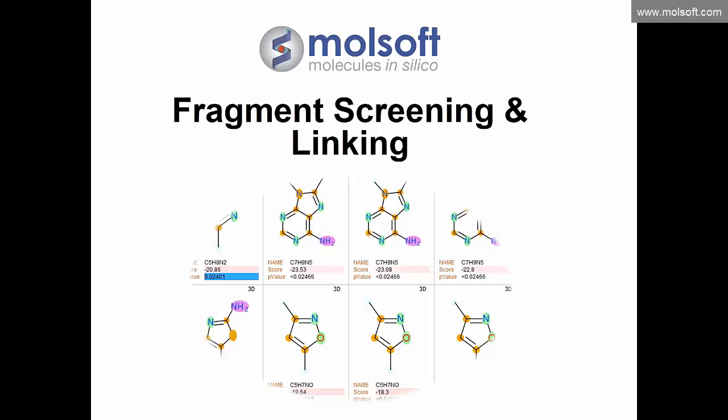Good morning. It's 9 a.m. here in San Diego, so we will begin the webinar. Thank you very much for joining us. Today's webinar is on fragment screening and linking.